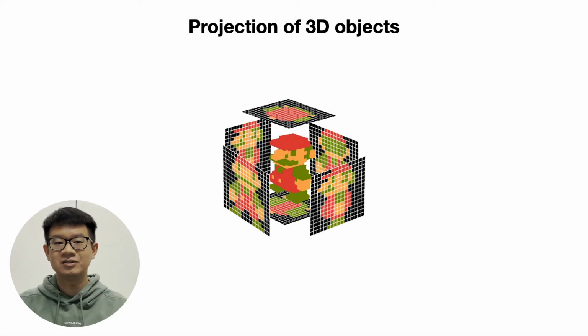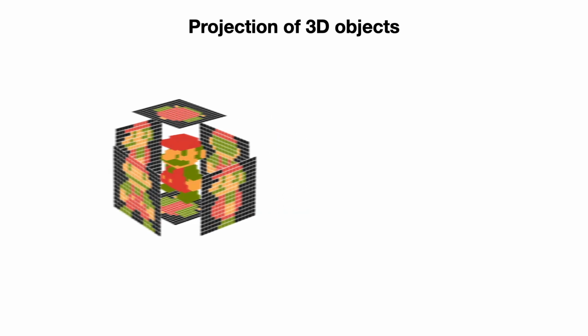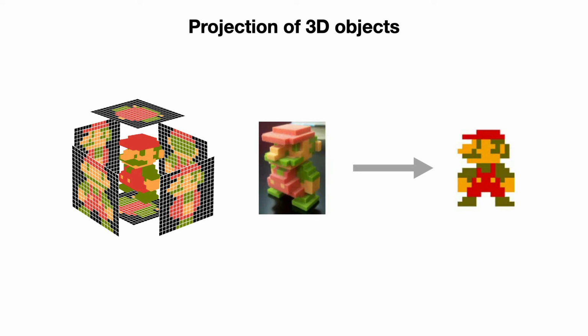As mentioned, the single-cell sequencing data we have is extremely high-dimensional. So how do we analyze the data and identify cell types based on that? One important technique is to project the data from high-dimensional to lower-dimensional space. Just as an analogy, we showed how we can project a 3D model of Mario to 2D space from different angles. Through a certain angle, we manage to reduce the dimensions, but are still able to preserve the important information such that you can identify that's a Mario immediately.